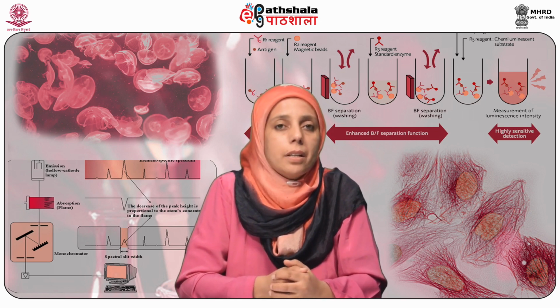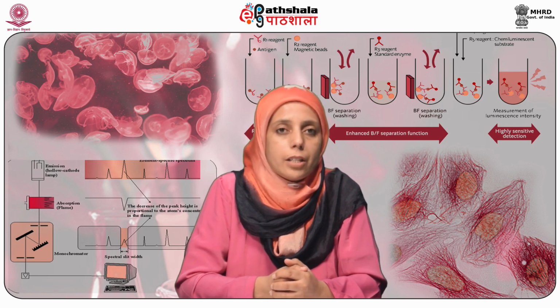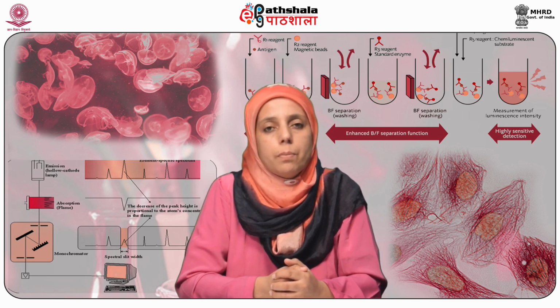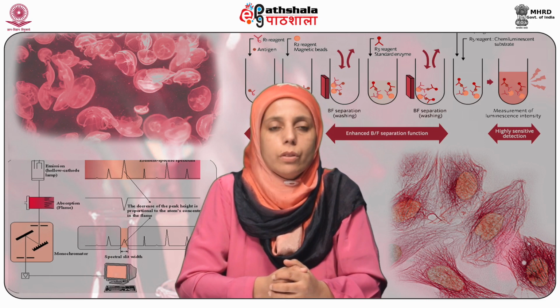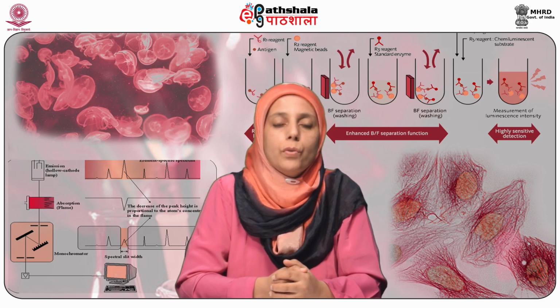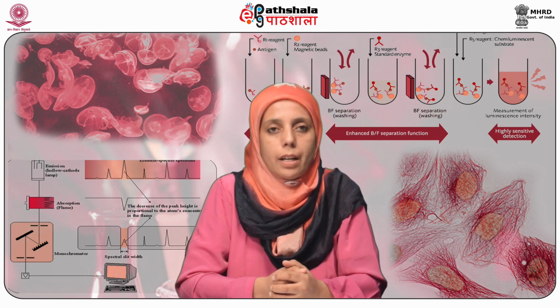The use of a light source that has a relatively higher intensity is desirable. For example, a mercury lamp can be used as it produces a satisfactory spectral range around 253.7, 302.2, 313.2, 435.8, 546.1 nanometers.